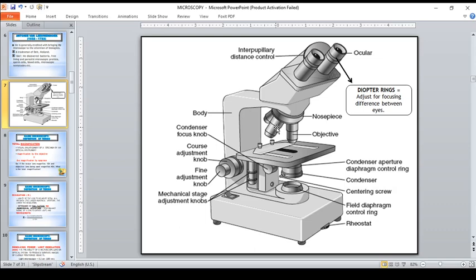And what is the color of the band? That is blue. Perfect. And lastly, we have the oil immersion objective or the OIO. And what is the color of the ring that is present in OIO? That is white. Okay, going to magnification, what is the magnification of the scanner?